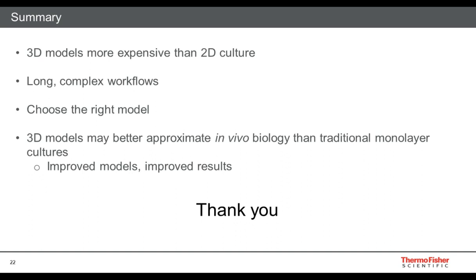At the end of the day, it's really going to require testing to find out, one, how healthy is the sample I made? Do I just have a ball of mostly dead cells? And what impact is that going to have on my model? Is it big enough? Is it too large? Does it have the cell types that are relevant? There's unfortunately no standard way of knowing if it's exactly what you need in advance of doing that sort of testing.